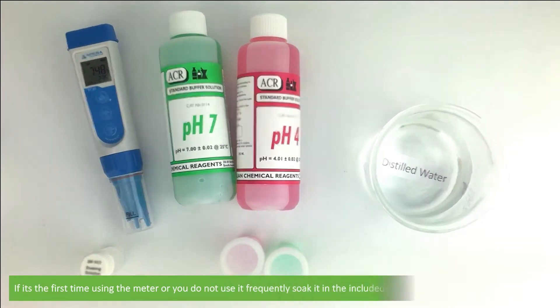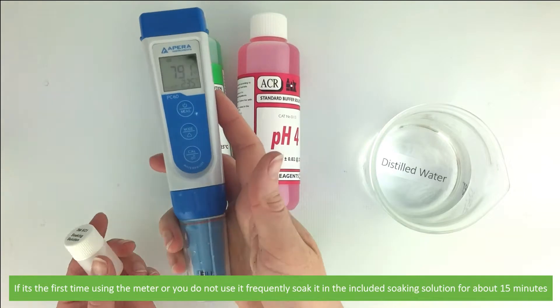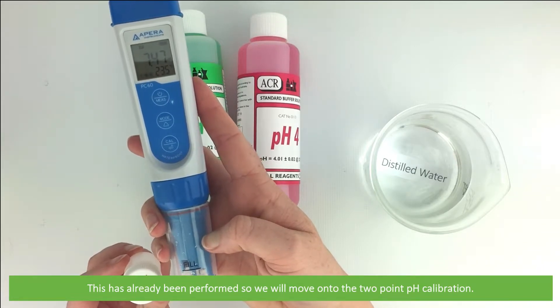If it's the first time using the meter or you do not use it frequently, first soak in the soaking solution for about 15 minutes. This has already been performed so we will move on to the two-point pH calibration.